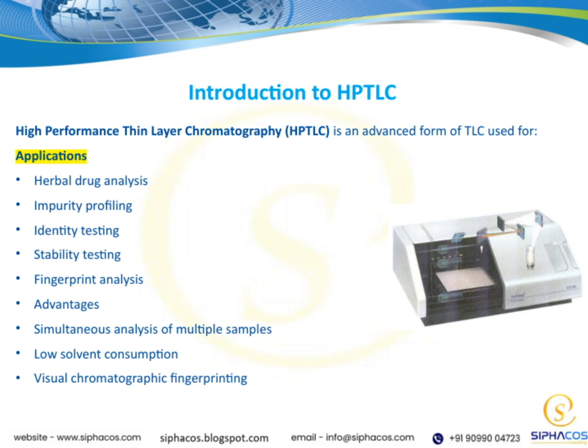And perhaps most interestingly, HPTLC allows for visual chromatographic fingerprinting, so we can directly see the unique chemical pattern of a sample, aiding in quick identification and quality assessment. Overall, these features make HPTLC a powerful tool in the analytical laboratory, especially when precision, efficiency, and environmental considerations are important. It really exemplifies how advanced techniques can enhance our ability to analyze complex samples reliably and efficiently.